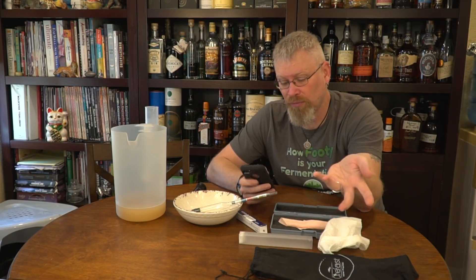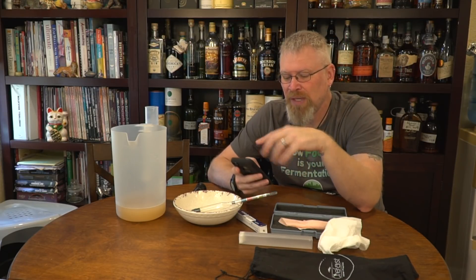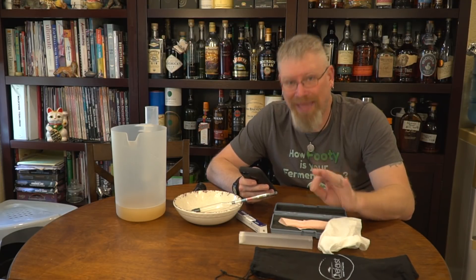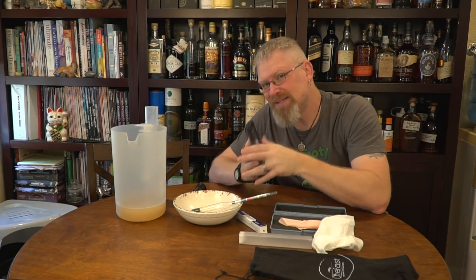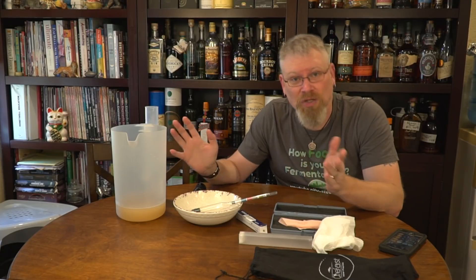So let's say 1.043 minus 1.000. It's 0.043, right? Some people will say 43 points, but it's actually 43 thousandths specific gravity. The next number that's very critical: you can use ABV calculators and all that, but it's really simple. Multiply that number by 131.25. That's it. That gives you 5.64% alcohol. I'd just say 5.6 because that 0.04 — how close am I? It doesn't give you 100% accuracy, but only a lab can really do that. What we're looking for is a rough guide — you want to know, is it 5.6? Is it 12? That kind of thing.